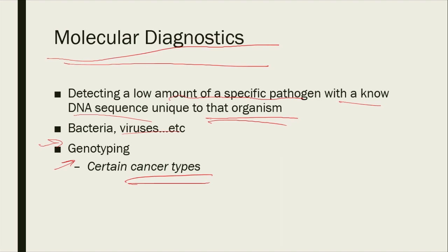So these techniques are very useful. Particularly these days, very shortly after we saw the virus causing COVID-19, we knew the complete genomic sequence. Then people can look at some of the unique regions in that virus and start going through the process of synthesizing primers, looking for primer regions that bracket a certain gene, to be able to tell if a sample contains a particular virus.